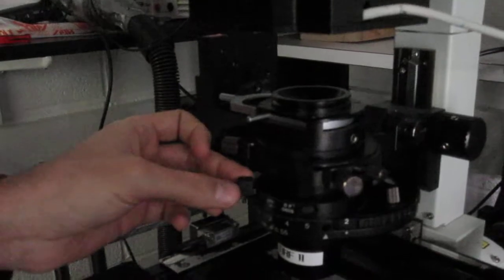This one would be in like that, and then you want to get this one out. It's out already. So in would be like that, and you want to have it out. And here too, you have to look for an empty position for bright field to check what's in the condenser. You can open this thing here, and here you can see what's inside.